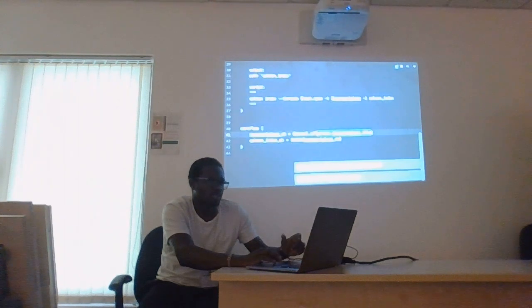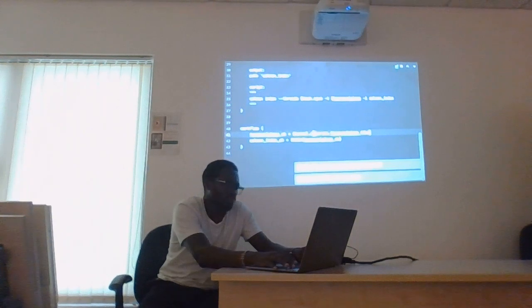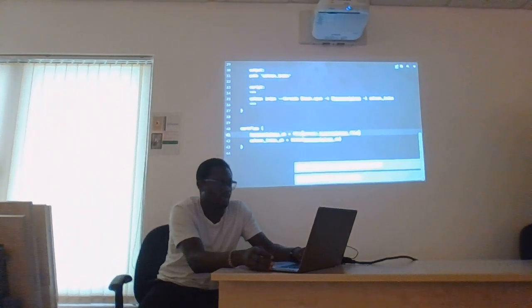So this is going to create a channel, which I now use as the input channel for the index. Try that. The other alternative would be to define it explicitly as a file, and that should work.